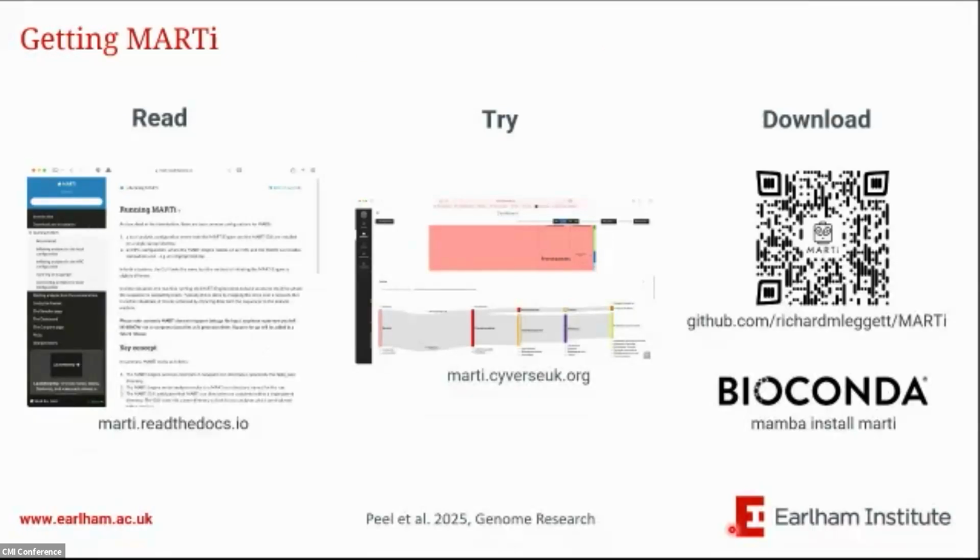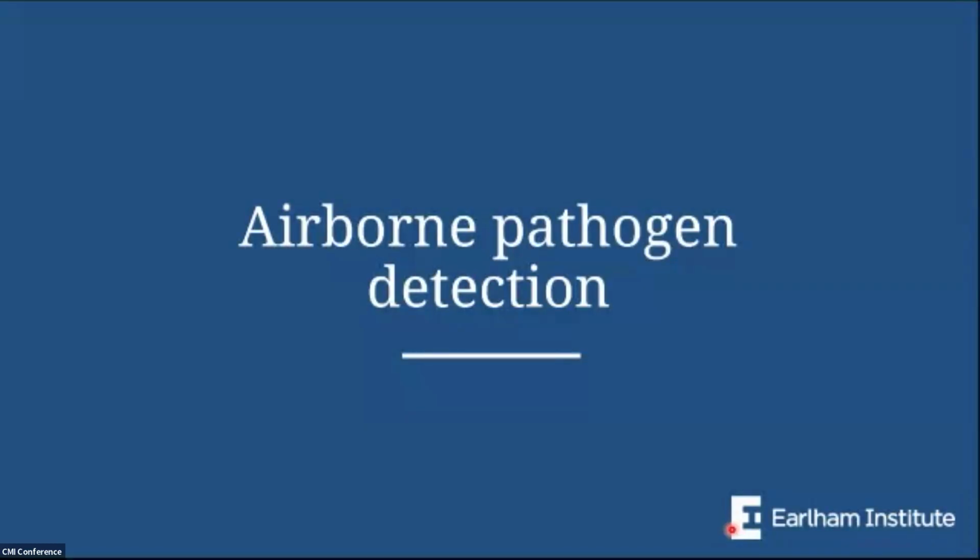And to install it, we've got a GitHub, and it's also available on Bioconda for probably the easiest way to install it. So Marty's become really key to all kind of metagenomics we do. It's our kind of go-to platform for nanopore metagenomics.